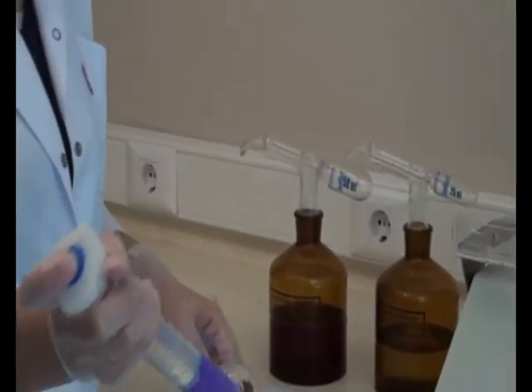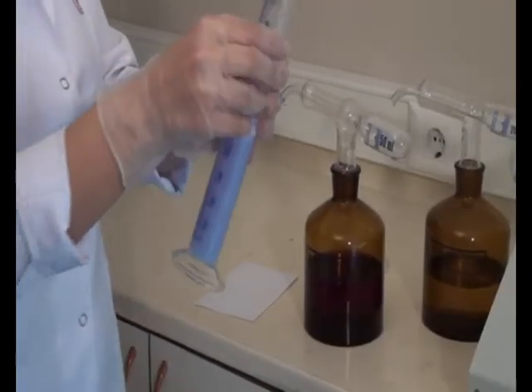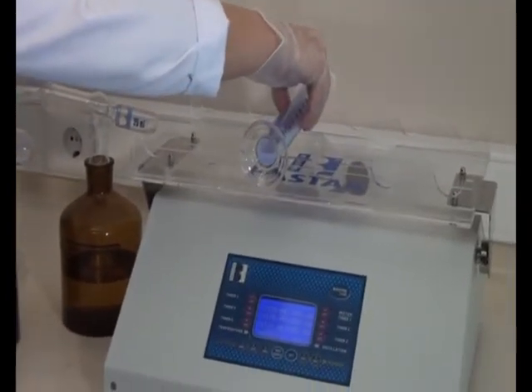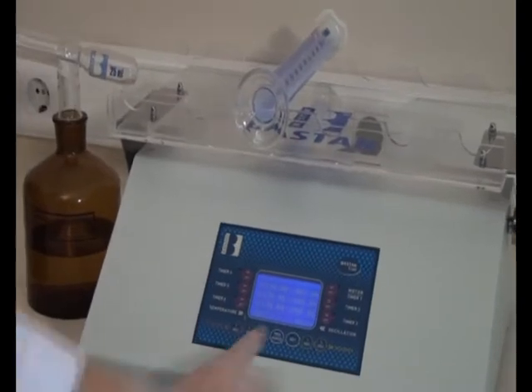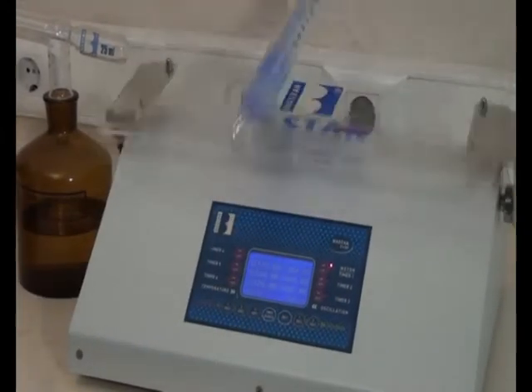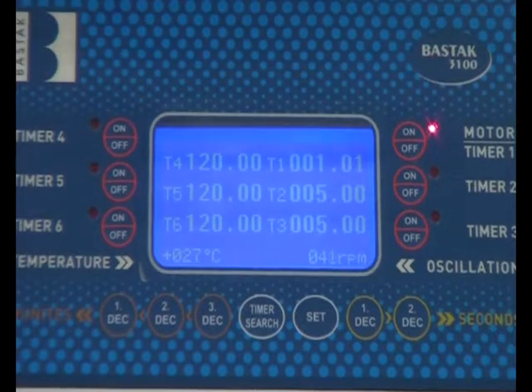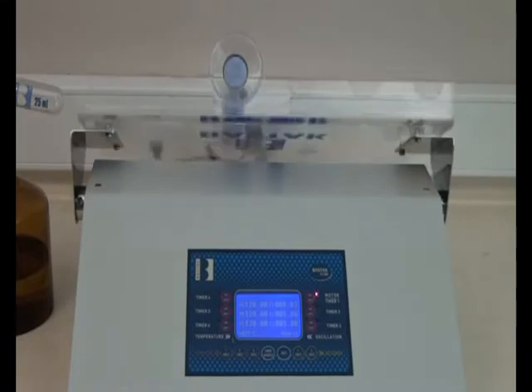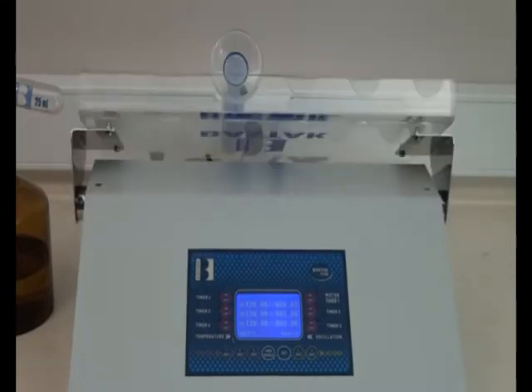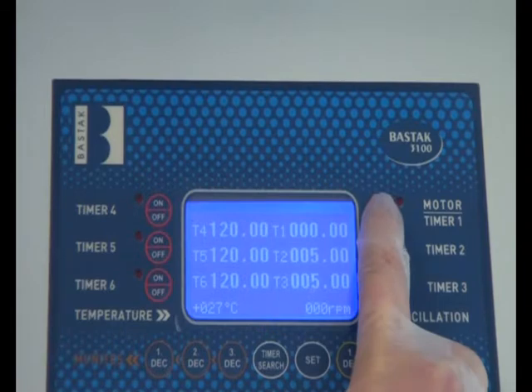The tube is shaken 10-12 times. After shaking, the sedimentation tube is placed into the platform and the motor timer 1 button is pushed. After the warning signal at the end of the 5-minute analysis process, it is right to press the off button.